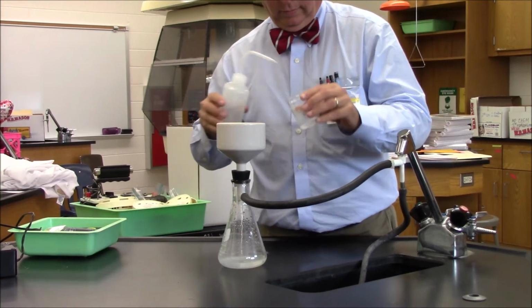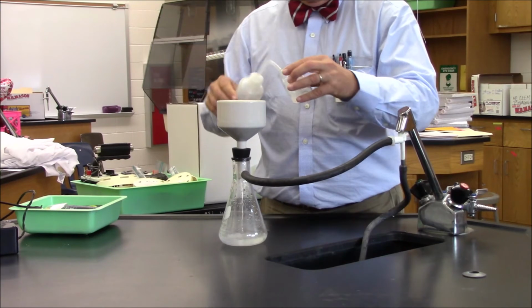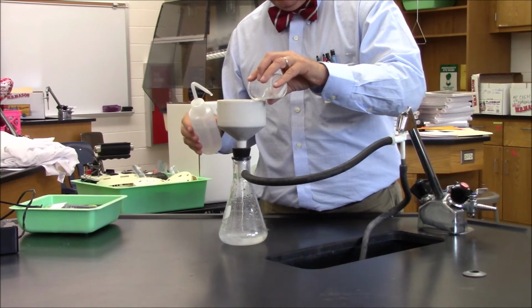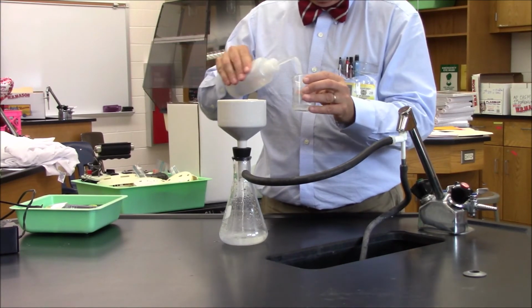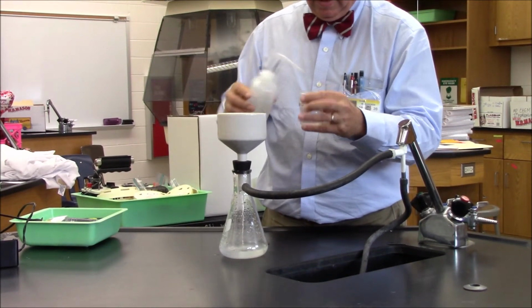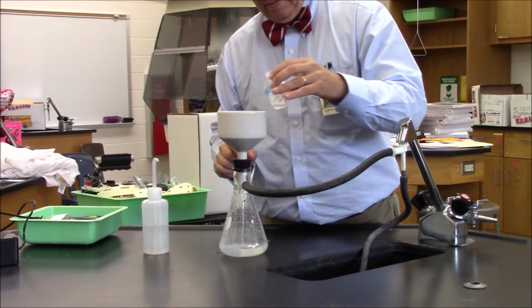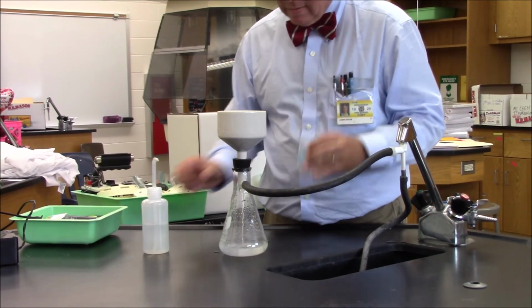Mr. Gottlieb's going to rinse, make sure we get all that precipitate out of the beaker. And once he's rinsed the beaker, he might even go a little bit further and rinse the precipitate on the filter paper.